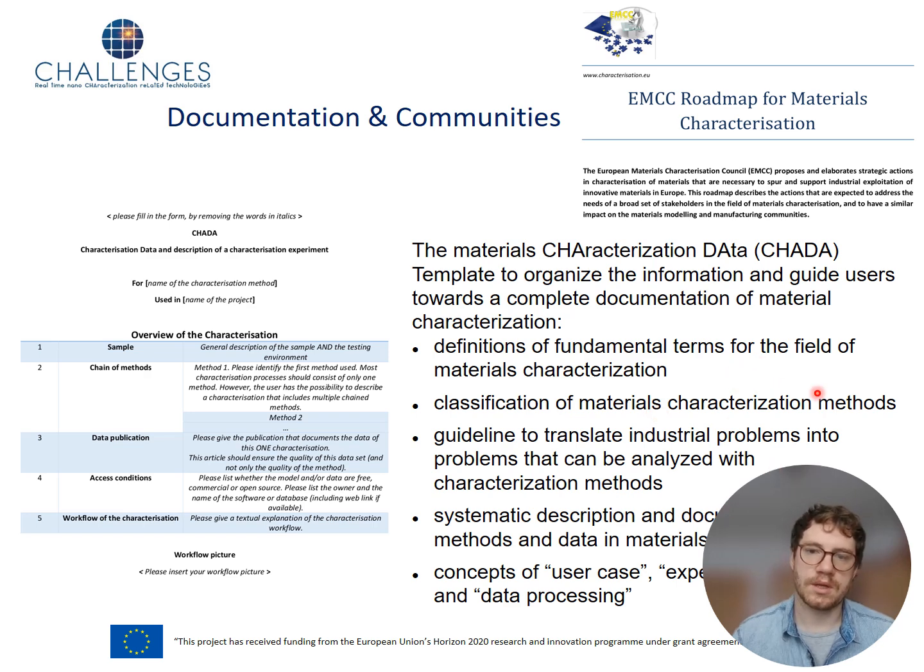So in the end, by executing the guideline, the conductor of the experiment is requested to define the general terms, classify the characterization method according to the groups that I talked about before, give also guidelines how this can be translated into industry, and systematically describe the data and the applied methods.